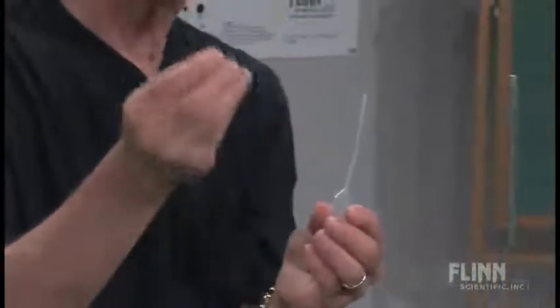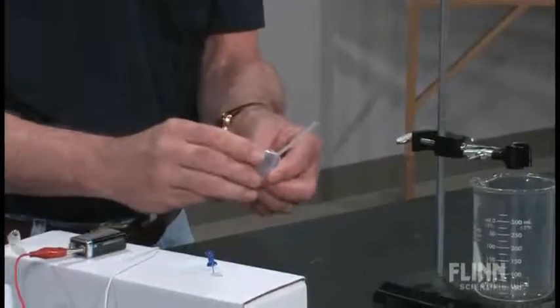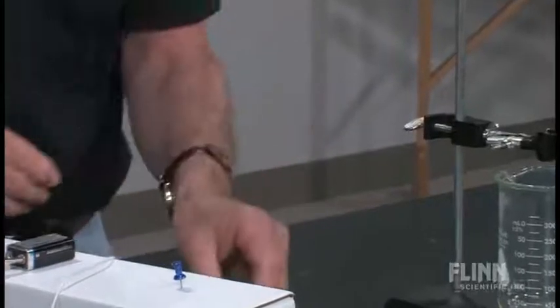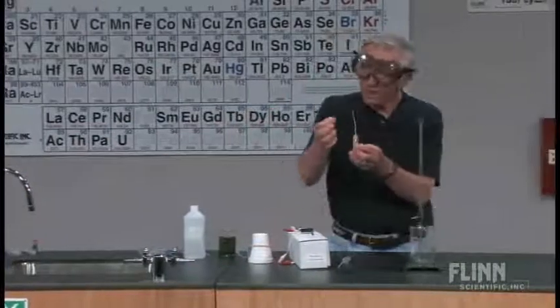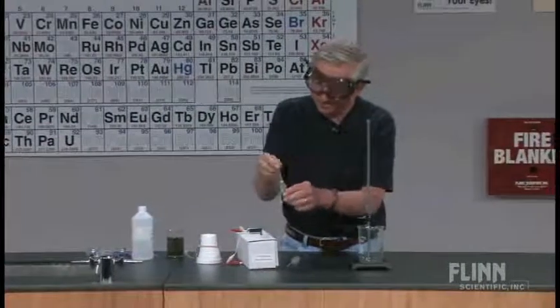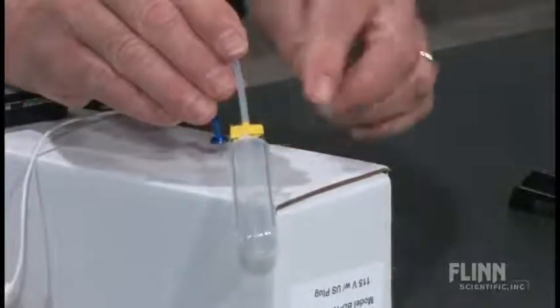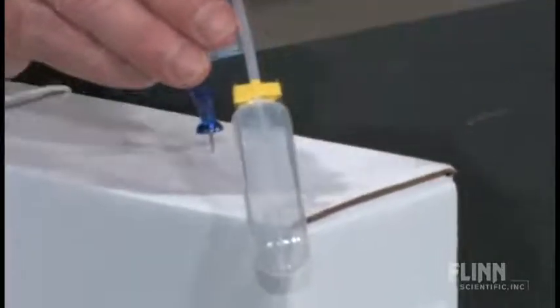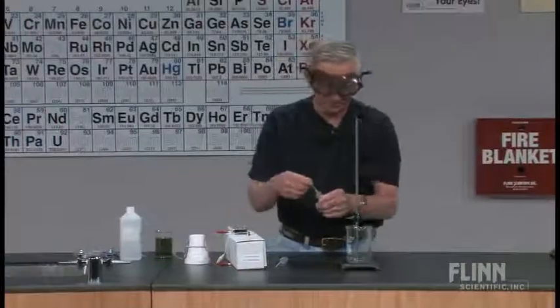To do that, we take a little push pin, like that, poke a hole on each shoulder of the jumbo pipette, and I wind up poking a pencil lead down each side. Put that right there. How's that? Here's one pencil lead. Here's another. I've got a little piece of tape here just to keep the lead straight up and down. It's all in the world it's doing.